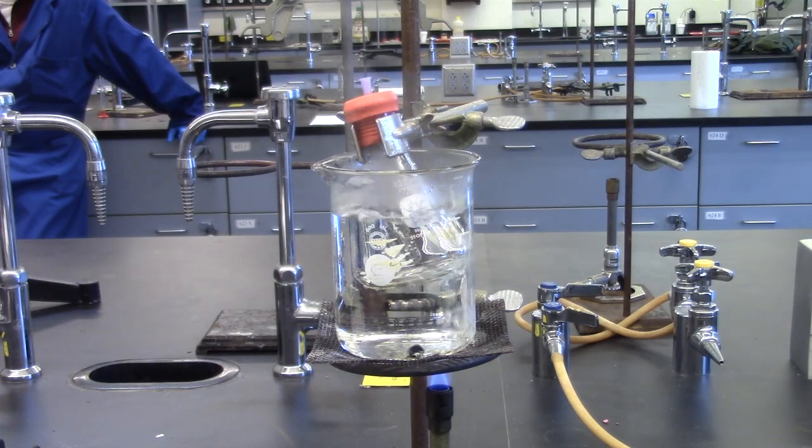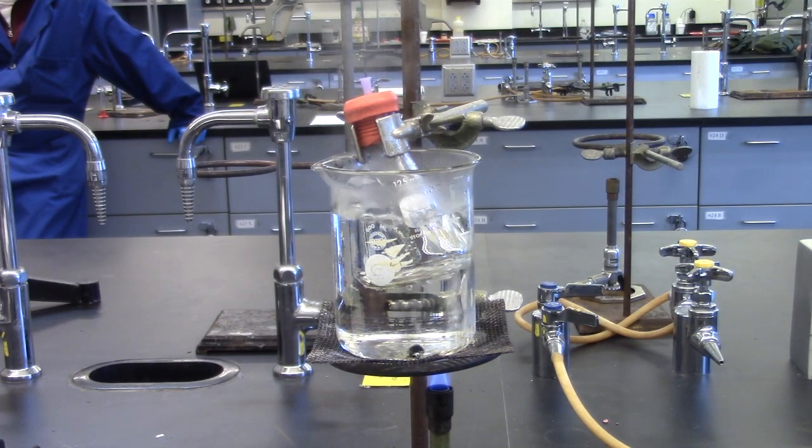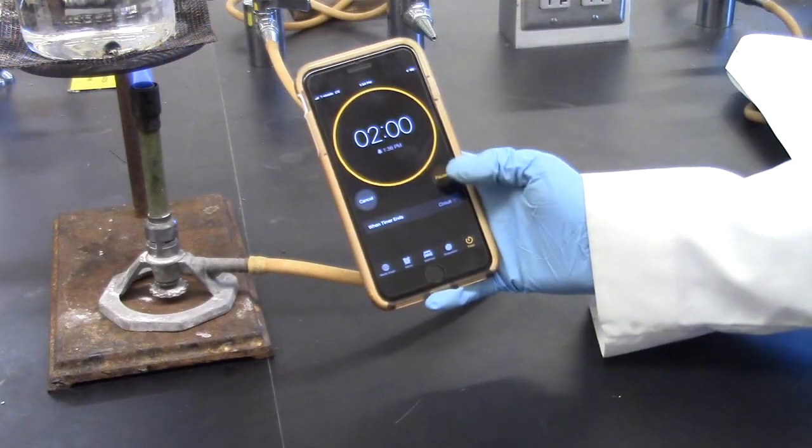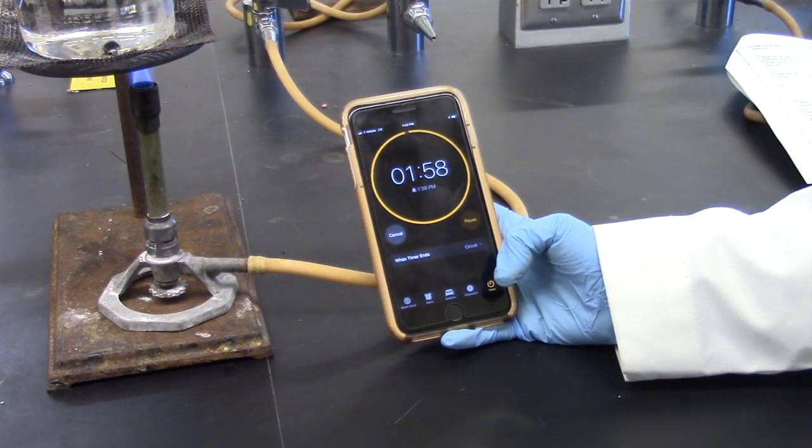Keep boiling until all the liquid in the flask has disappeared. This should take approximately 15 minutes. Continue to boil for an additional two minutes after this point.